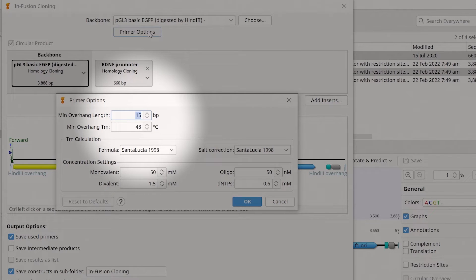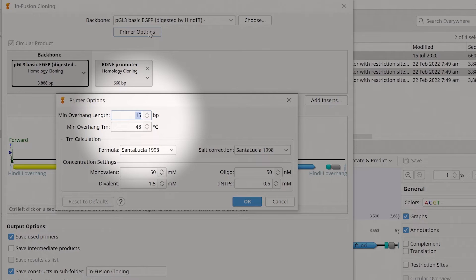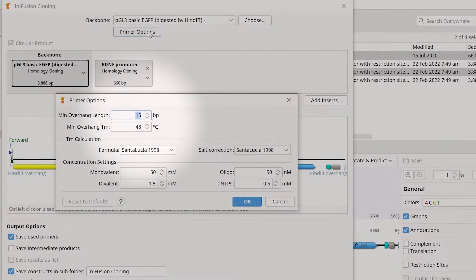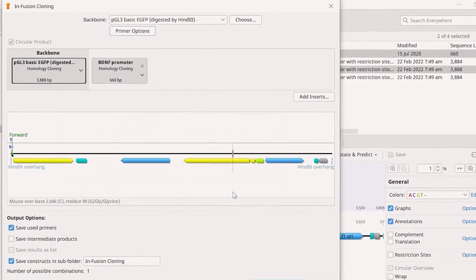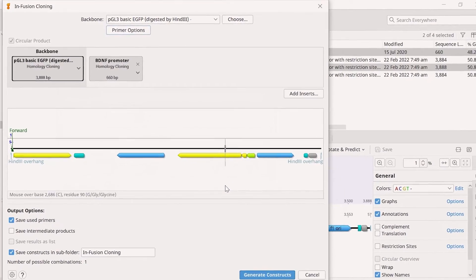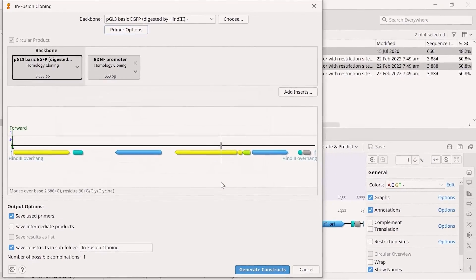This is the length of the annealing bases, the complementary sequence part that two neighbouring sequences will have in common after the operation. You can also adjust the desired minimum overhang melting temperature in this window. Click OK once you're happy with the primer settings.